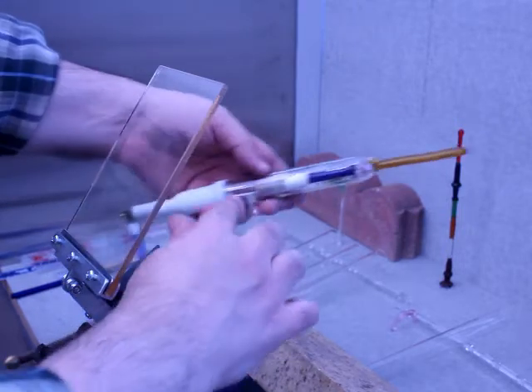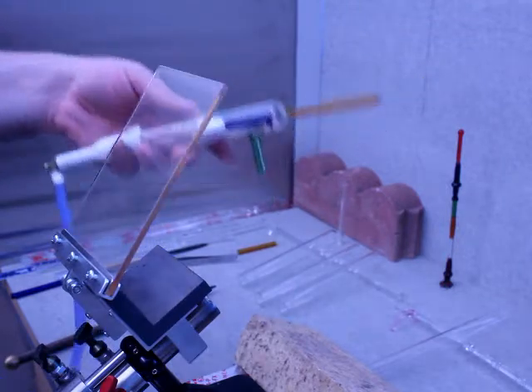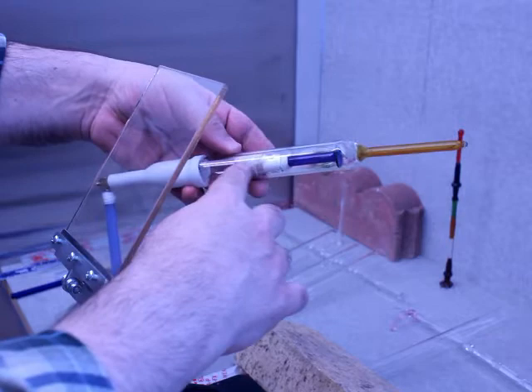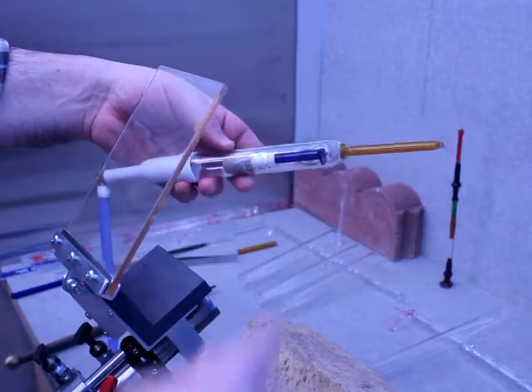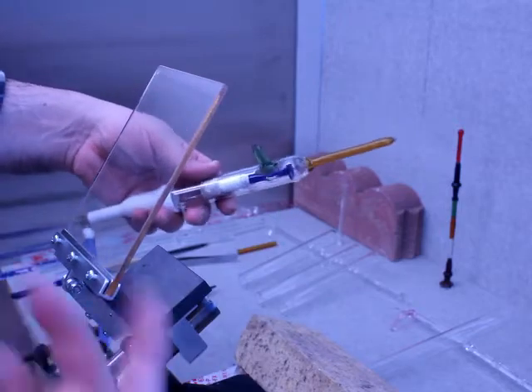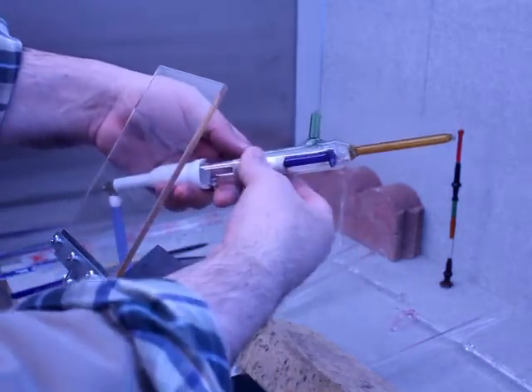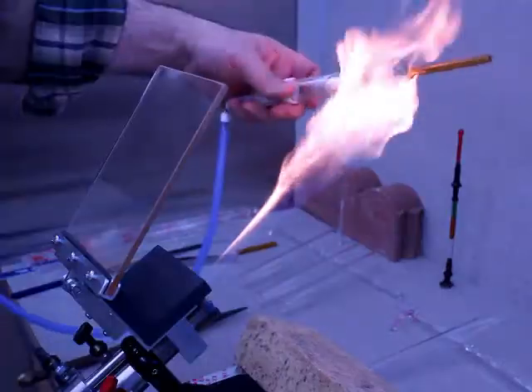What this little adapter allows me to do is position my ring seal where it needs to be, and I still have my blow hose all connected. Now, I've got a little bit of a Kim wipe in here and a little bit of paper towel, simply because the 14 millimeter diameter spacer that I'm using should be 20 millimeter. So I need to make a new adapter, but for now this is fine for this particular test piece.